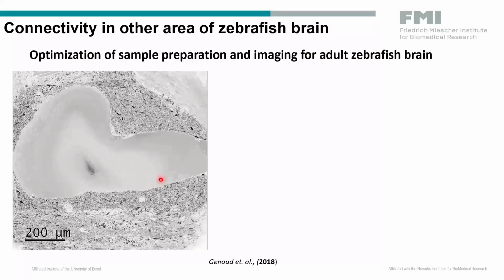It's not a different tissue. It's just that the stage of the zebrafish, compared to larvae, maybe requires a different preparation. So you see here the part of the cortex, or telencephalon, and you see this gradient of stain, very nicely stained around the surface of the tissue.